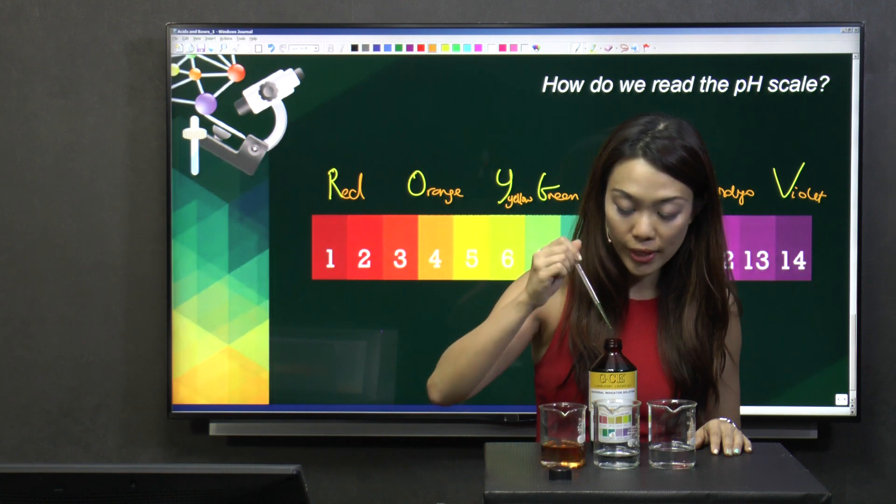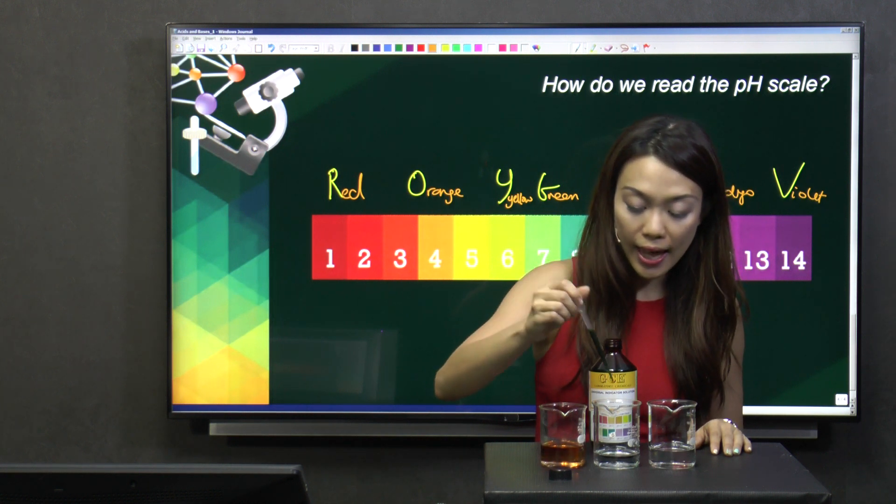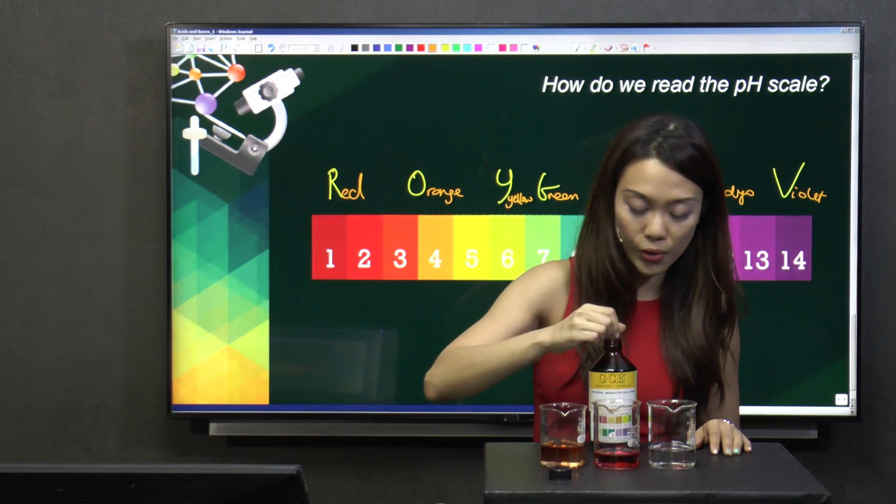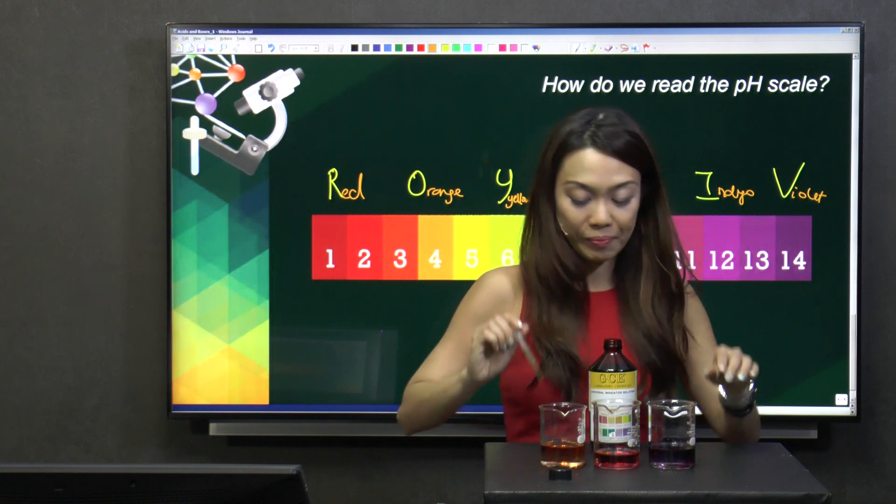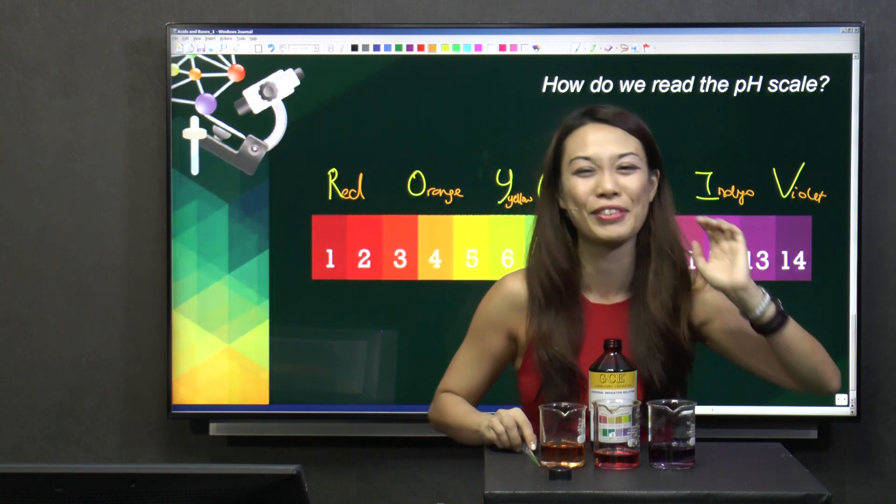Oh, okay. I see some colours. And let me drop this. Whoa. Okay. And how about this? Wow. Alright. Thank God I didn't drink any of them.